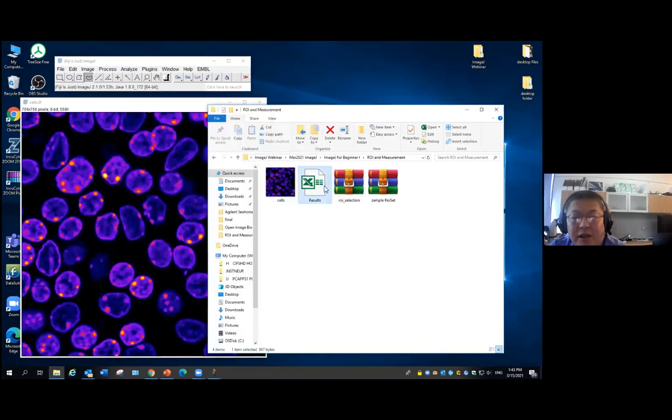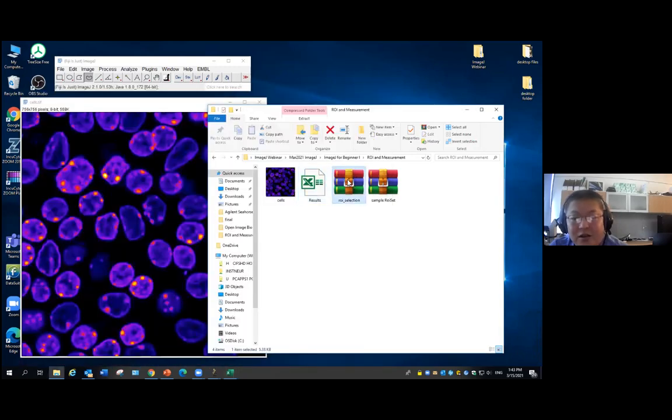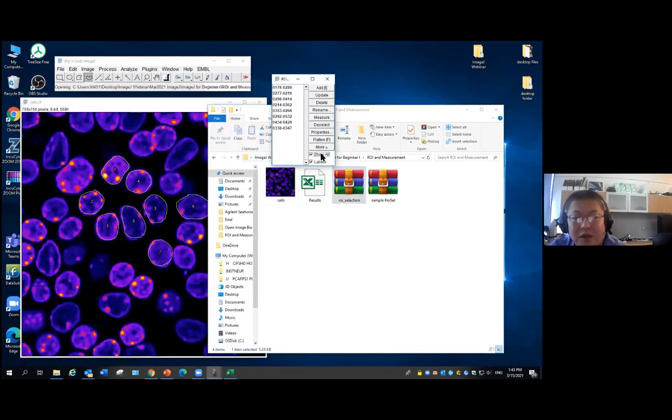So now when we have the result, we have 8 cells. And where are they? Are those 8 cells? That's here.